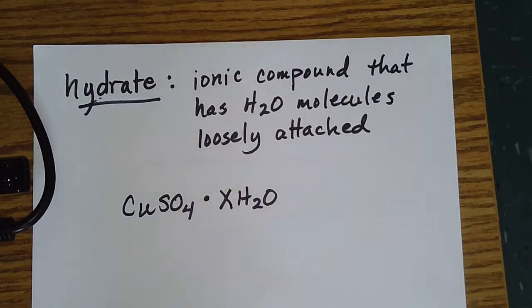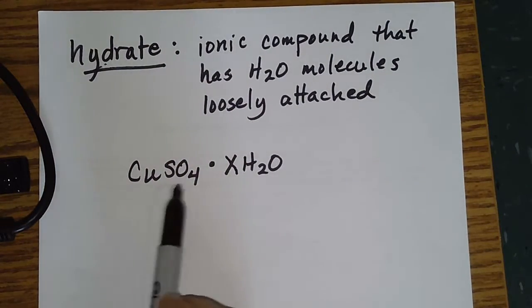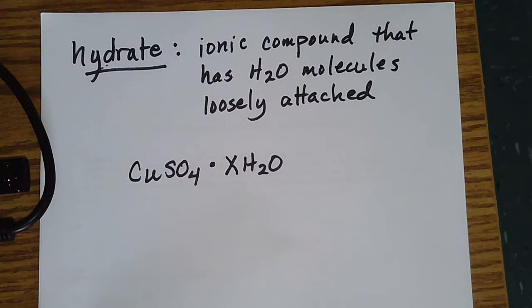All right, so what are we going to do tomorrow? Well, we need to separate the copper 2 sulfate, the ionic compound, from the water. And we just talked about how we can do that easily. Now, you're not going to throw it in your dryer at home. That would be weird. But we are going to, and you can probably see around the room, what do you think we're going to use?